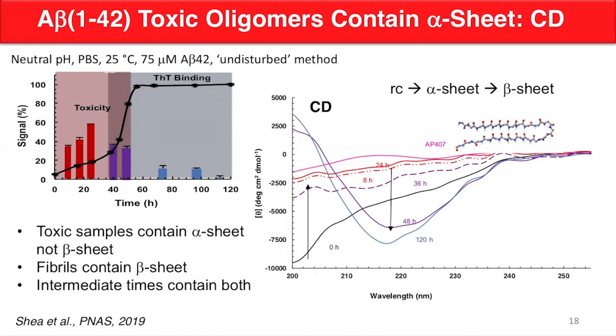Now, it's not entirely flat because we've got L-amino acids at the ends and in the turns, but it most definitely lifts and flattens out. From 8 hours, it lifts a little bit more to 24, and it becomes similar to that magenta curve, which is for the structure that we determined the NMR structure of, where we have a high resolution structure.